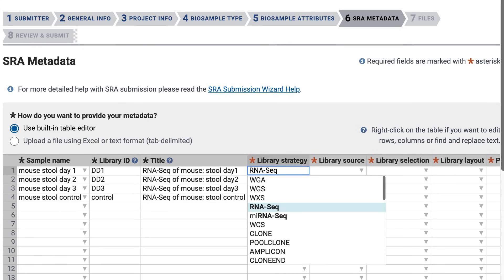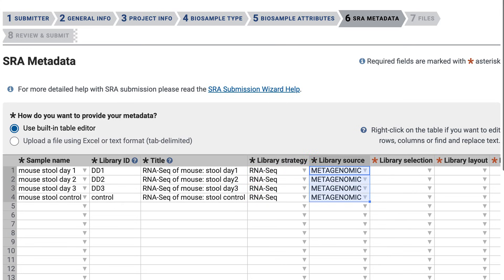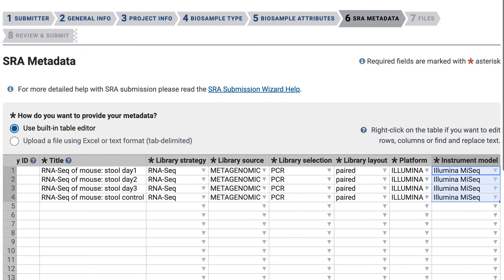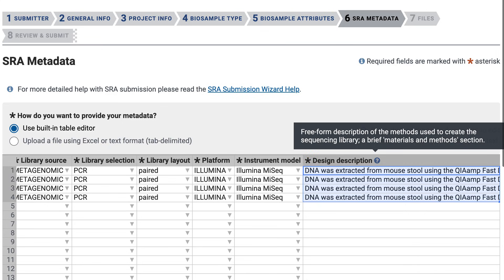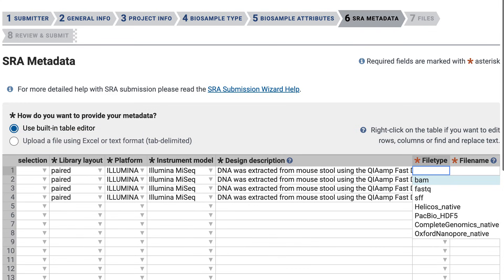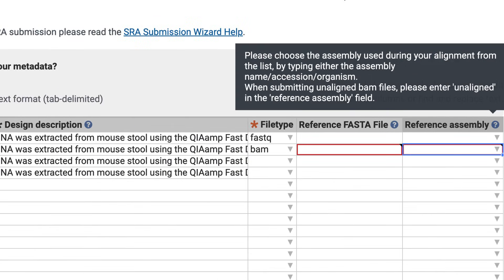I'll move quickly through the next several fields, but notice the pull-down menus. Library strategy is rnasek. Library source: metagenomic. Library selection: PCR. Library layout is paired. Platform is Illumina, and instrument model Illumina MiSeq. I'll paste in a design description, which is a free text field that should include detailed information about your experimental design and library construction protocol. For file type, use the pull-down menu to see the accepted file types. Mine are all FASTQ, but I'll demonstrate that if you choose BAM, two additional fields appear. You must fill out one of these fields — see the help tip for more information.